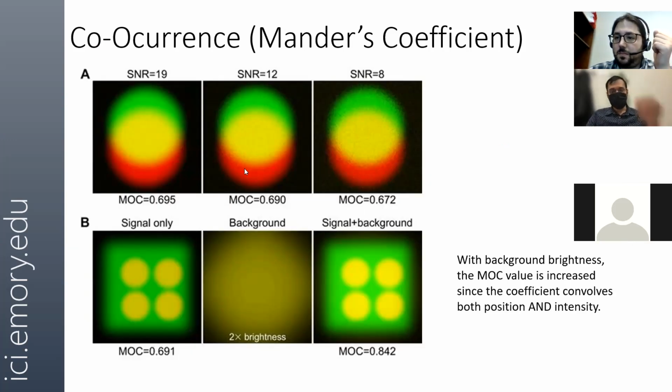So Stoyan, it's a great point to make over here, which is if anybody's goal is to in fact measure co-occurrence or co-localization using Manders coefficient, and they are imaging using a confocal microscope, they should really make sure that they use the feature of line averaging, so that all this pixelation that you are seeing with low signal-to-noise ratio gets averaged out, and you get something which looks like a signal with a higher signal-to-noise ratio, and that will increase your Manders coefficient. Mm-hmm. That's a good point.